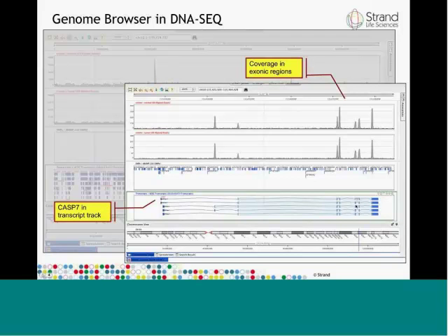Just like the previous RNA-seq example, the key idea here is that by taking a look at the genome browser and the coverages across chromosomes and across the samples, we should aim to get a feel for what the data is saying.